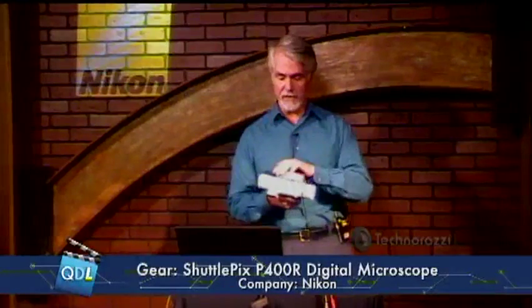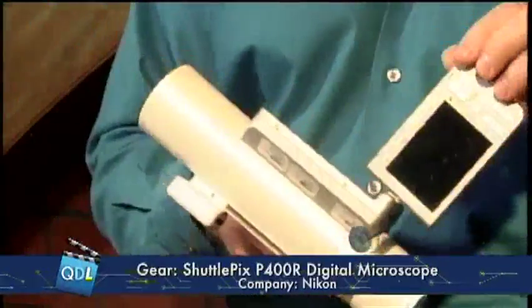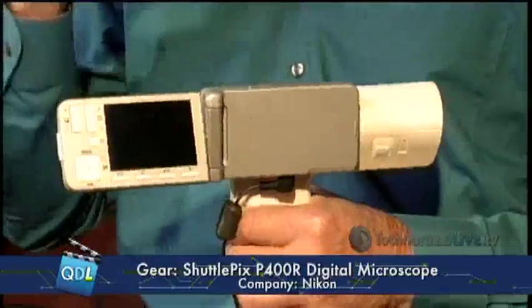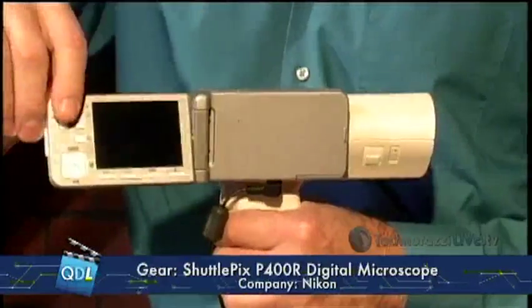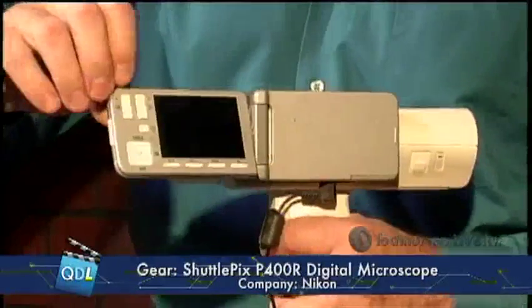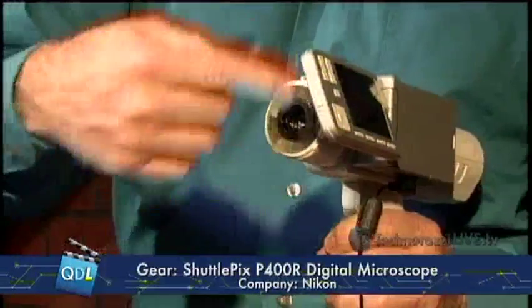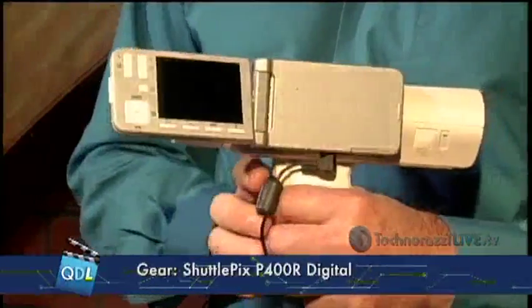Let me show you what the camera looks like. This is a digital camera that captures microscopic images as still images, not video — so it's a still image camera for microscopic use. It has an easy flip-up view screen and basic controls: light intensity, zoom, a button to control which LED segments are on, and navigation buttons.